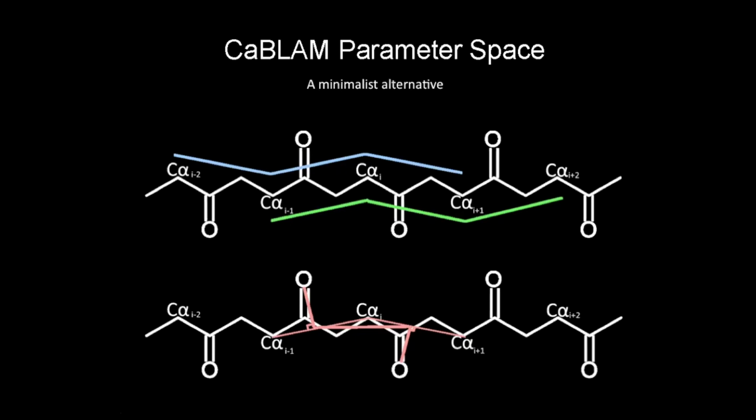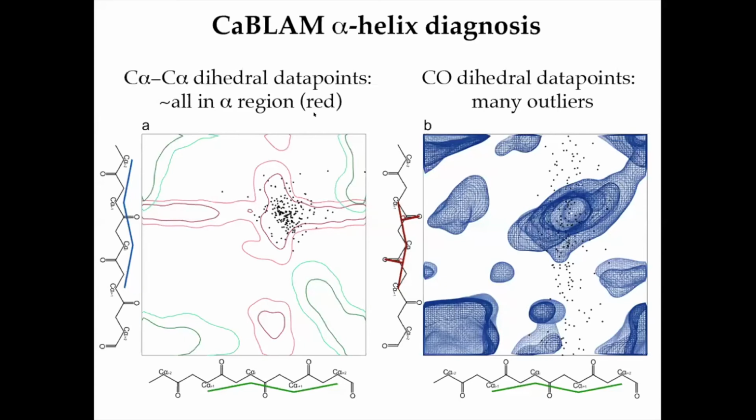And so you can plot these much better in 3 dimensions. So here are the 2 virtual C alpha dihedrals, one coming into the residue and one going out. So it's a little like phi psi, but over a much wider span of the structure. And for these, this is a structure that has really dire helices.